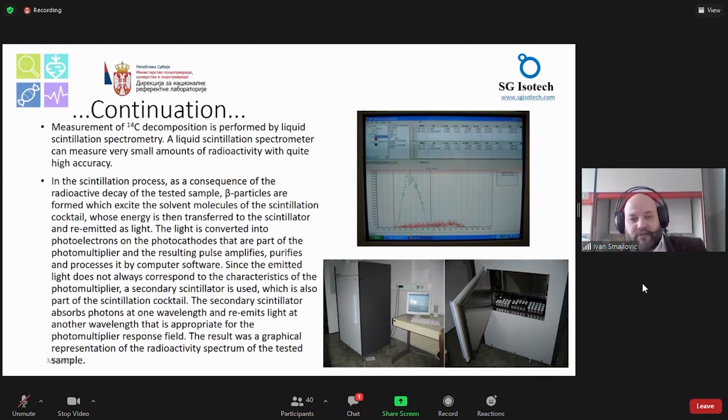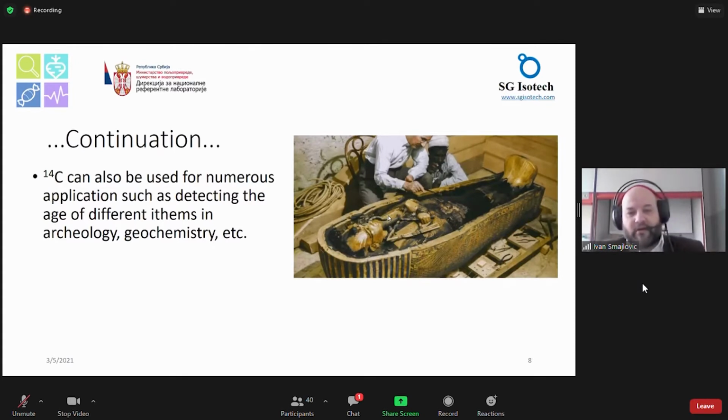But if you go further into the past, before the Second World War, you will end up in the same natural range as we have it today. So before the Second World War, when we didn't have nuclear weaponry and everything else, we can see from those samples how old they are by the decay of carbon, the concentration of the 14C in them. So it is used, for example, for archaeology, where you can say how old, for example, this mummy or this sarcophagus is. Is it 9,000 years? Is it 10,000 years? This is all about this 14C.